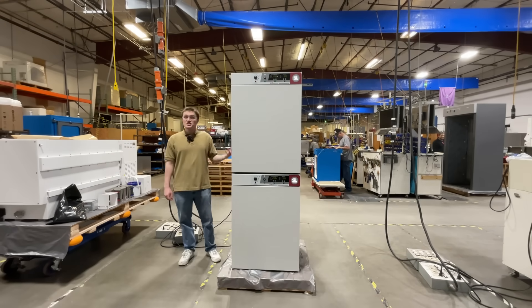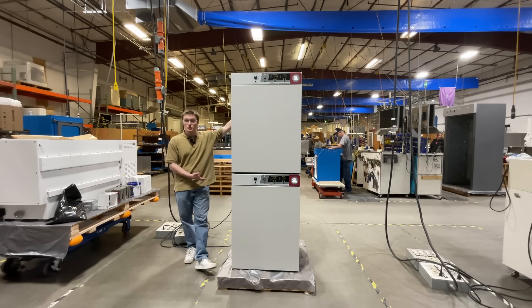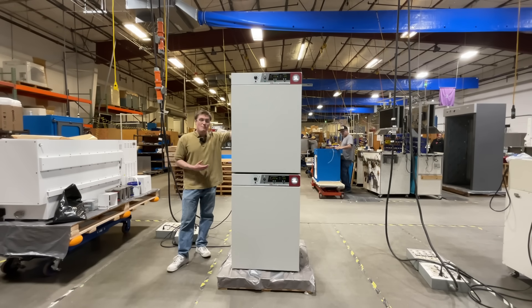Our stacked Shell Lab SCO-10A CO2 incubator is ideal for use with cell cultures, stem cell research, microbiological studies and academics, biotech, and pharmaceutical industries.